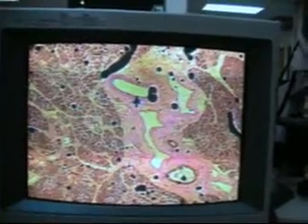Now let's just go up in magnification and see if we're right about that. Okay, so this crap that's on the right there, sorry about that. Somebody was chewing tobacco or something, I don't know.